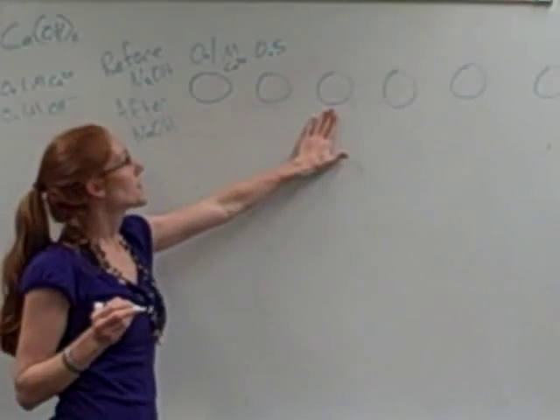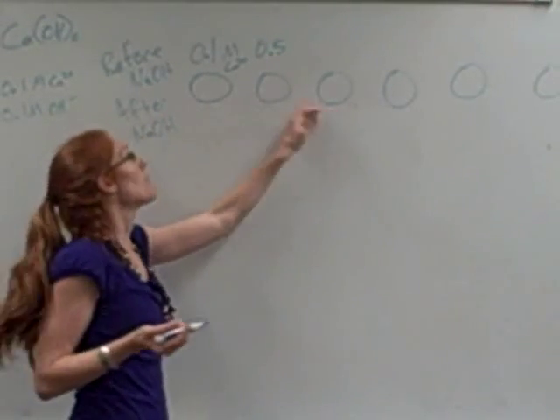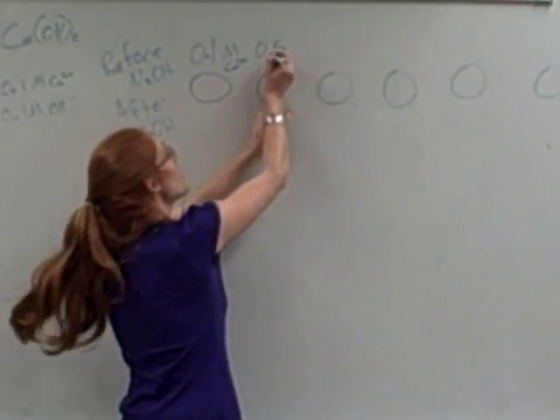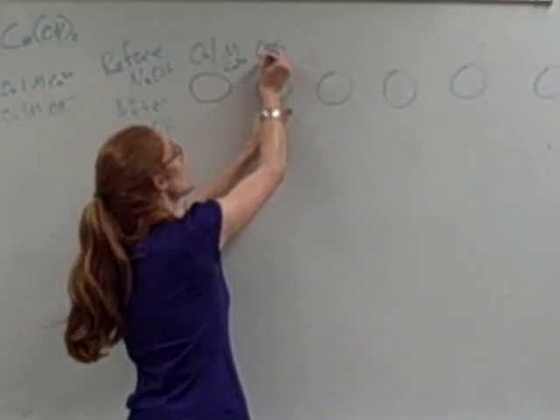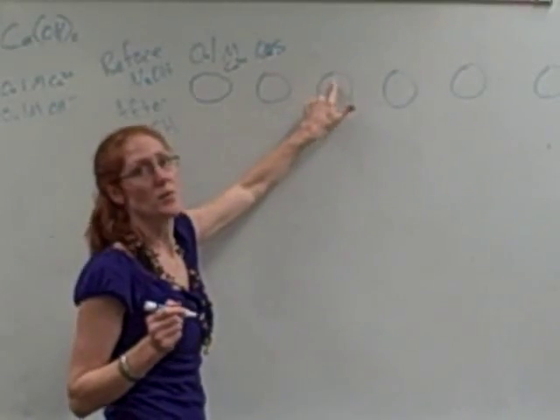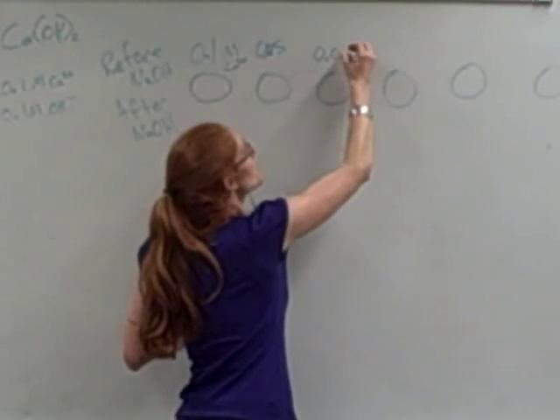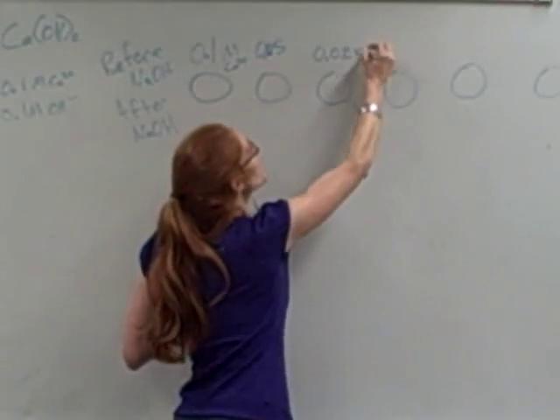And then in the next situation, I'm going to take 5 drops from here, so 5 drops of 0.05 molar, and 5 drops of water, put it in here, so it ends up being I have now doubled the volume, so I have half the molarity again.